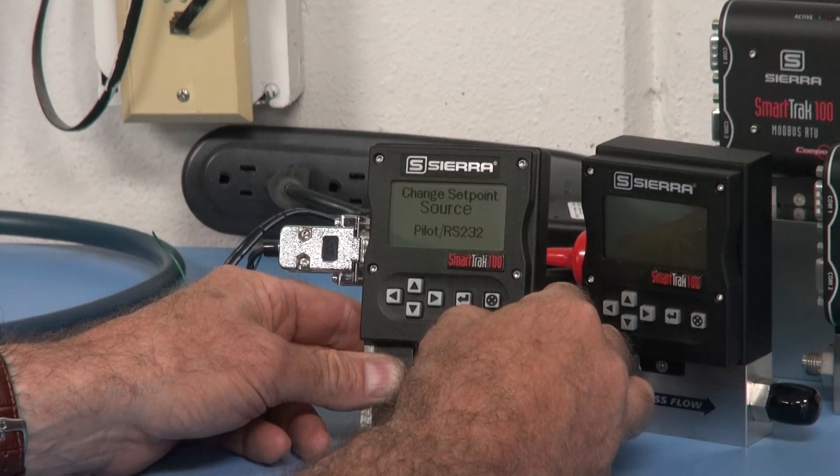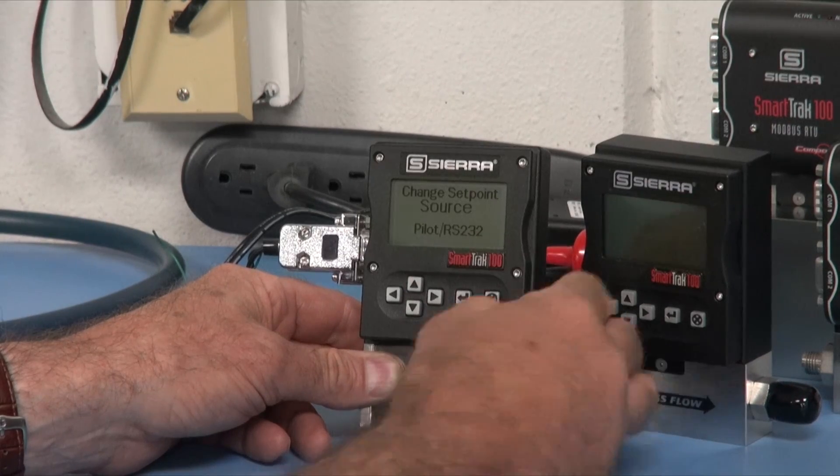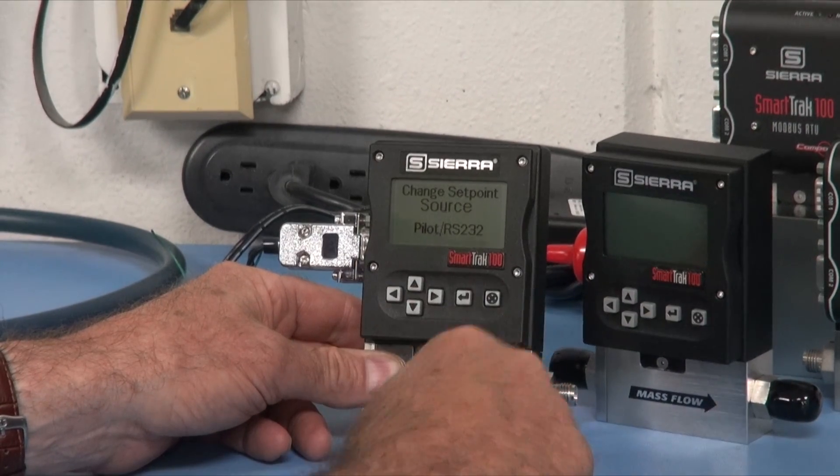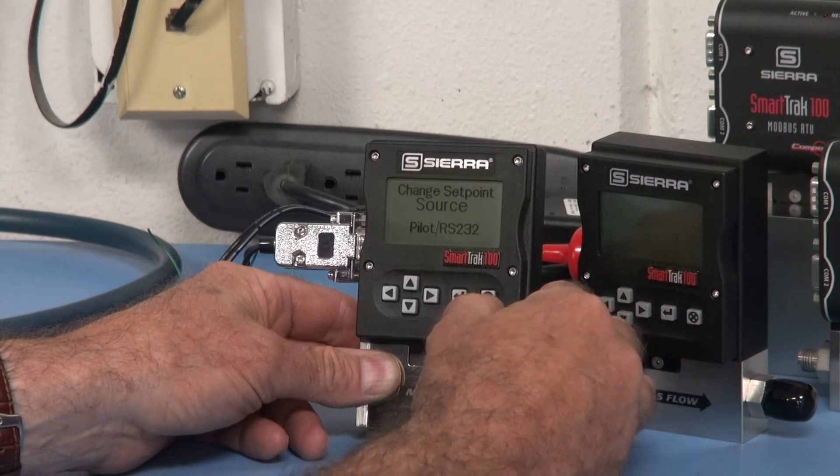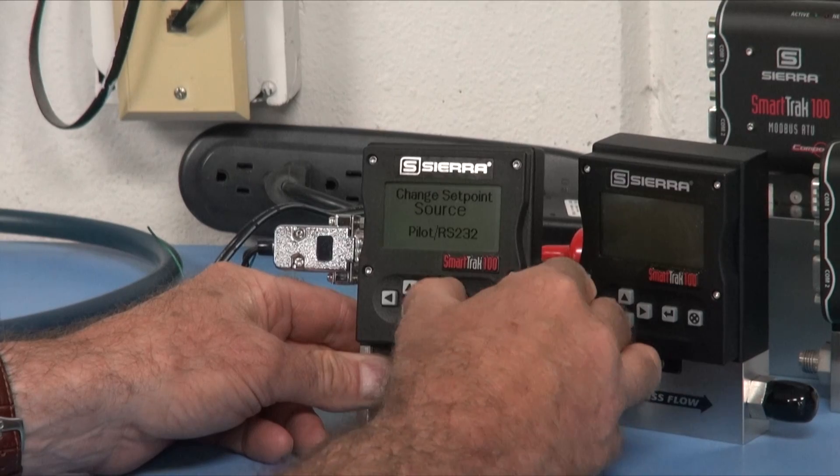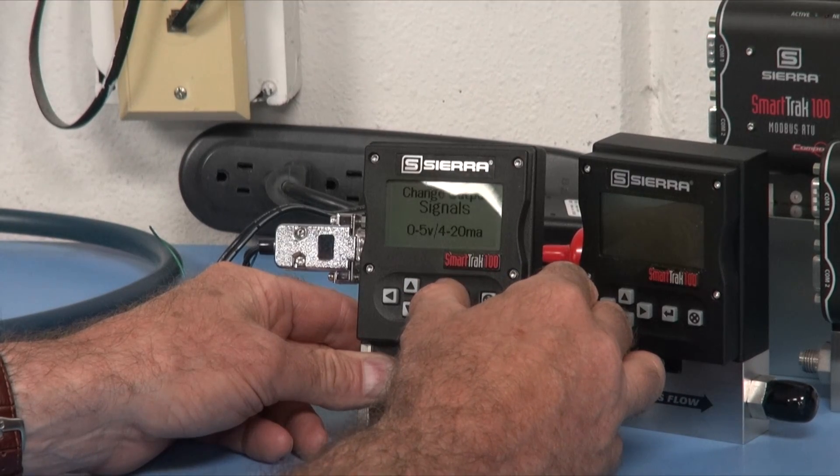You can also change the set point source. This would have to be set up for pilot RS-232, so your computer or the screen. You can also change to analog signals, and then we can change the output signals.